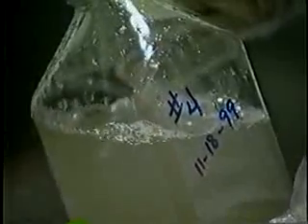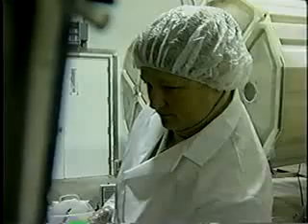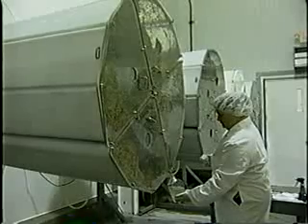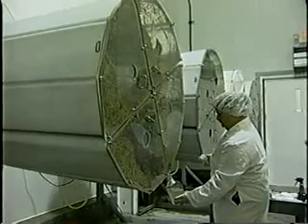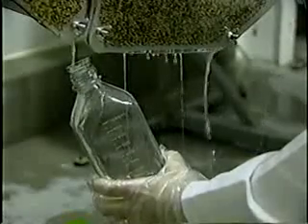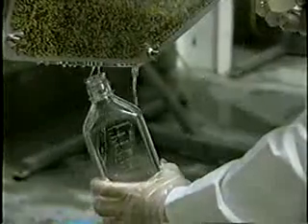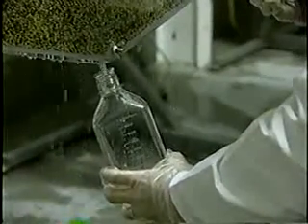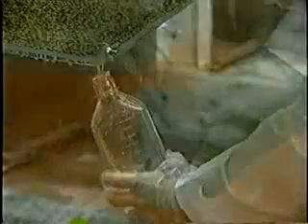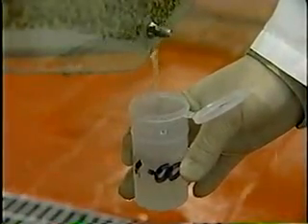Containers should be properly labeled to identify the sample, lot, time, and date of sampling. Sample collectors should wear a clean lab coat, gloves, and hair covering in order to prevent contamination of the sample by the collector. Any sampling instruments, such as cups or tongs, should be protected from contamination before and during use, and used only once so that each sample is taken with a fresh, sterile utensil. The sample container should be filled about 3/4 full to prevent overflow.